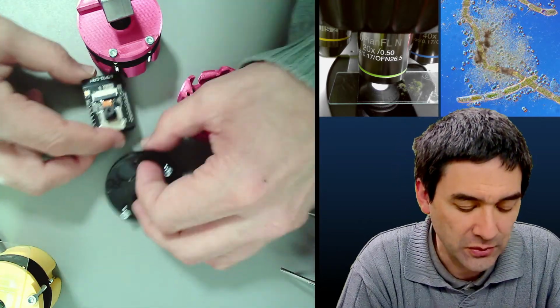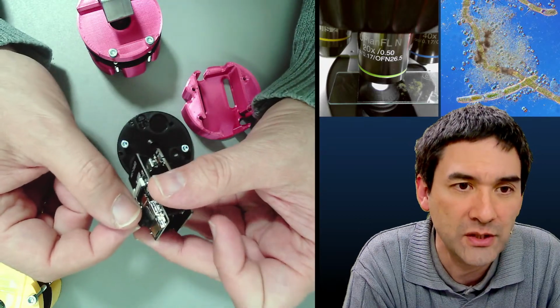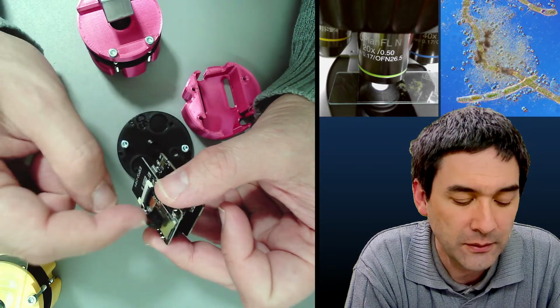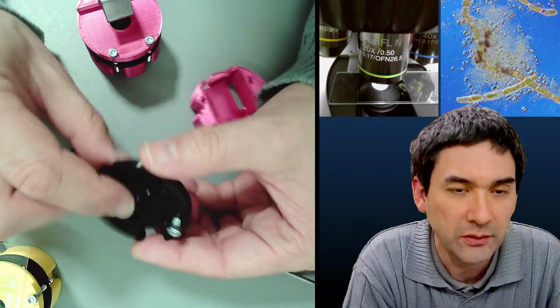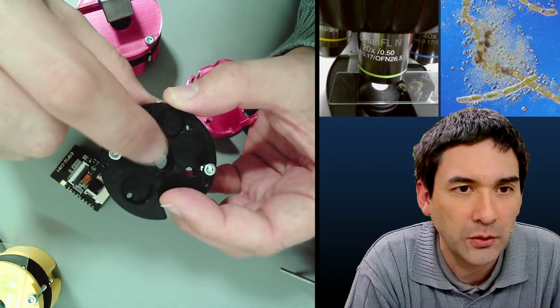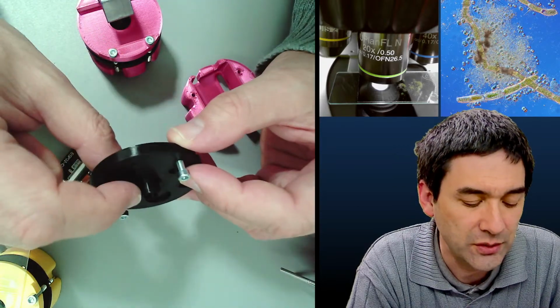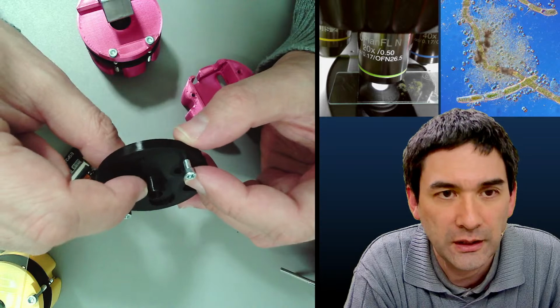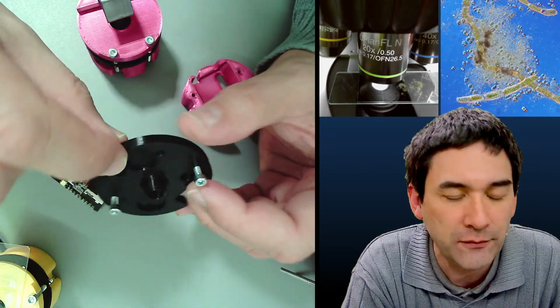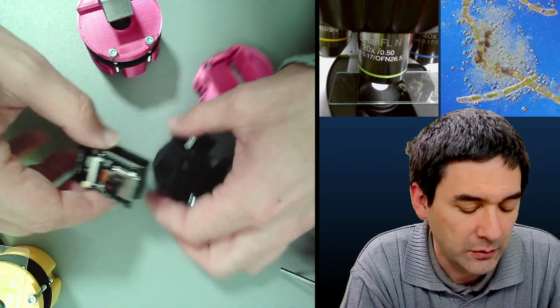What you have to do, and I'm not going to do it now, is unscrew the lens and connect it on top here, with the sensor on the other side. It's raised maybe a centimeter away from the sensor, which increases the magnification. It's quite a nice thing.